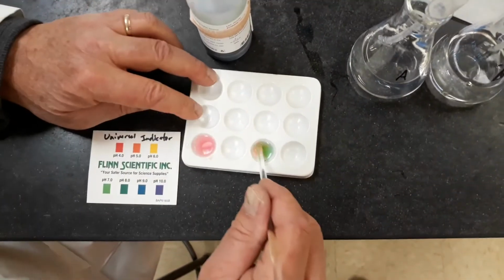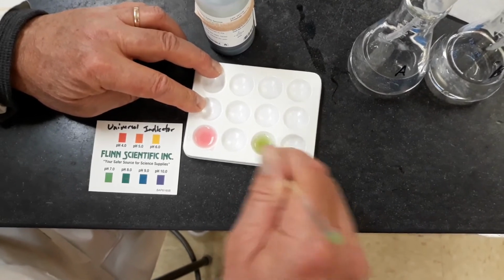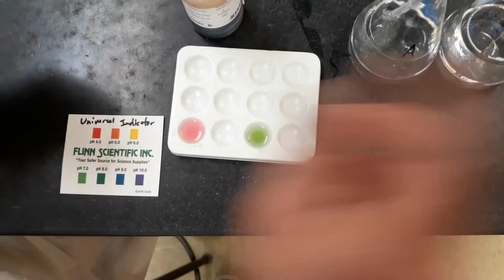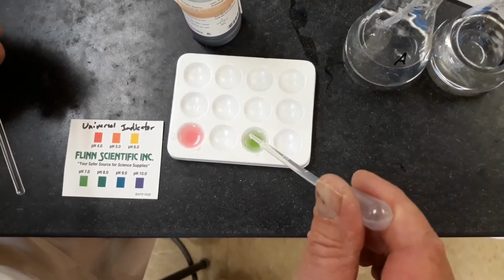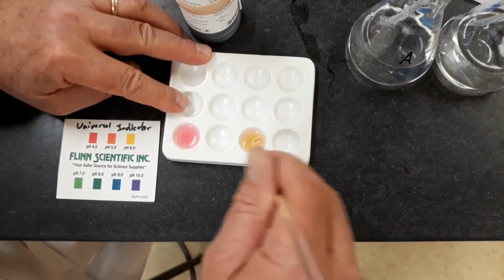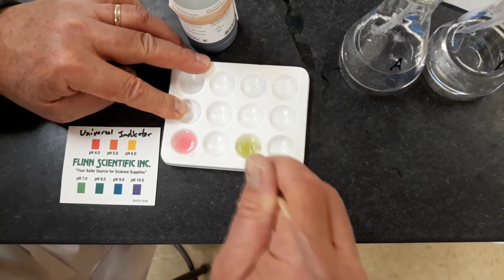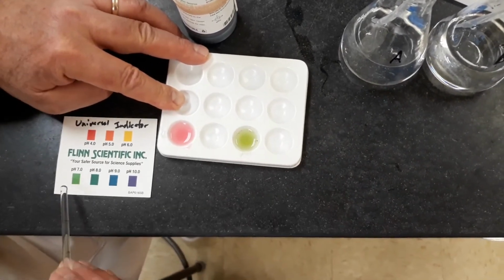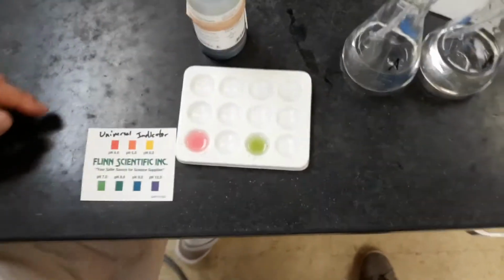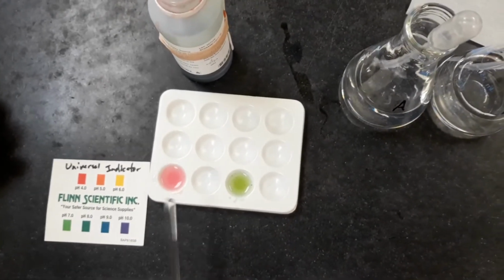Okay. And we can see that we're almost neutral. Let's go one more drop. 3. Is that 7? Okay, so evidently B is a little bit stronger than A. But they've neutralized each other.